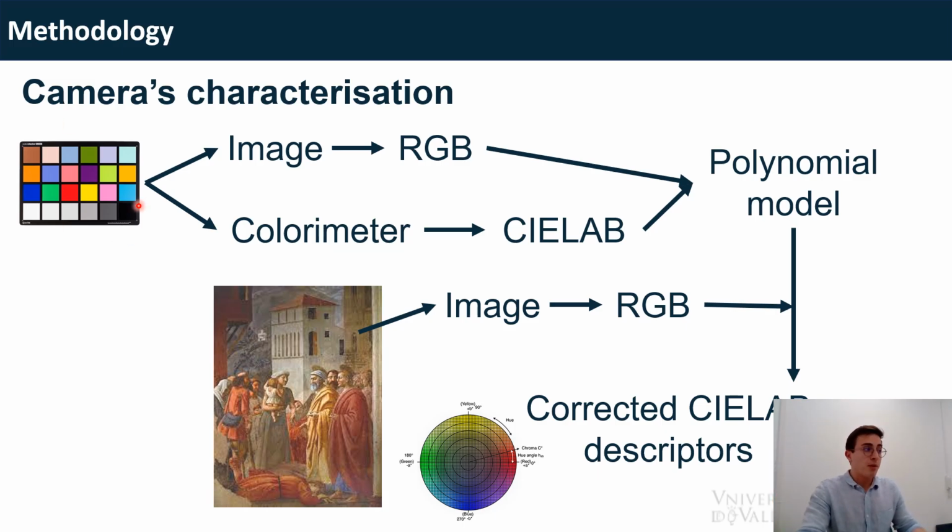So this color patch, we will measure it by a reference colorimeter, which will yield CIELAB color coordinates. These color coordinates are basically like points in this graph here. It will give us this point, for example, telling us that it's this red, this yellow, and we have to imagine a third axis coming out of the screen, which will be the lightness.